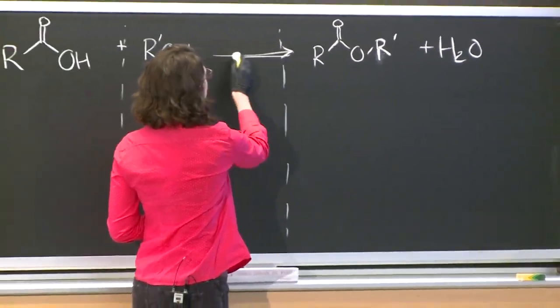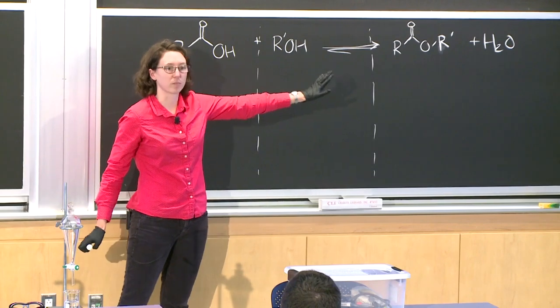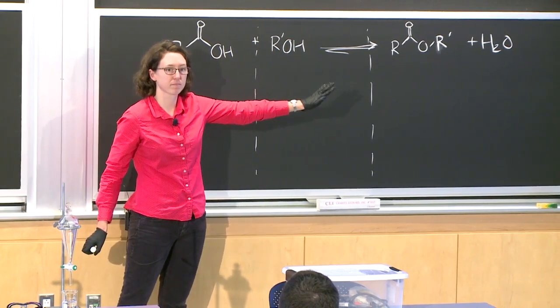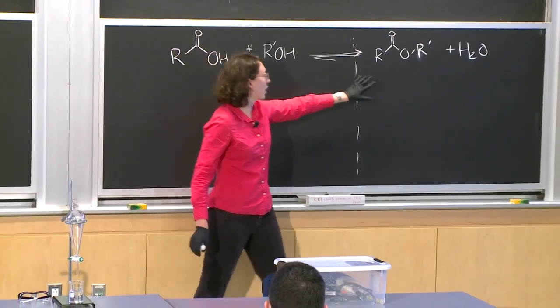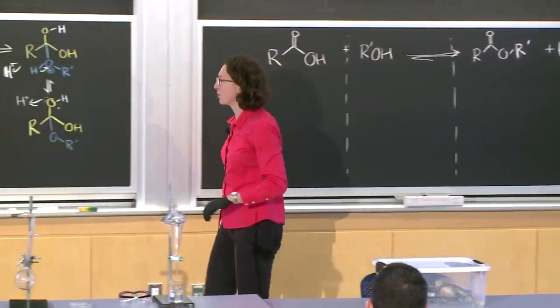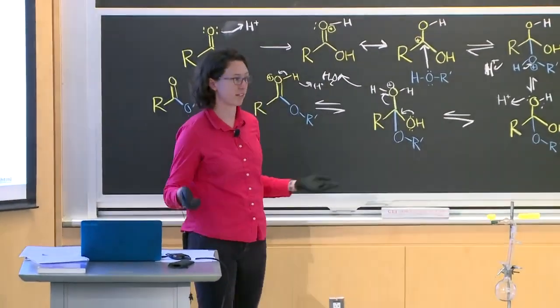and this is a reversible reaction, then how can we force the reaction to go towards the product side? Take out the water. You can either add more reactants or take out the products, and so we are going to be taking out the water with our drying tube, and that will help ensure that our reaction goes to completion while we are refluxing.